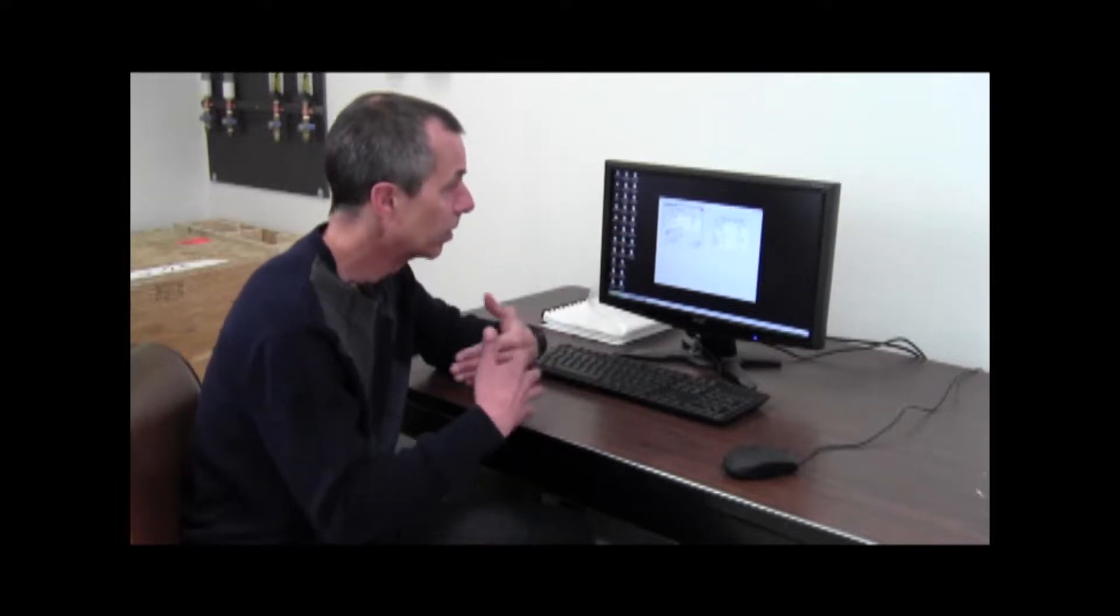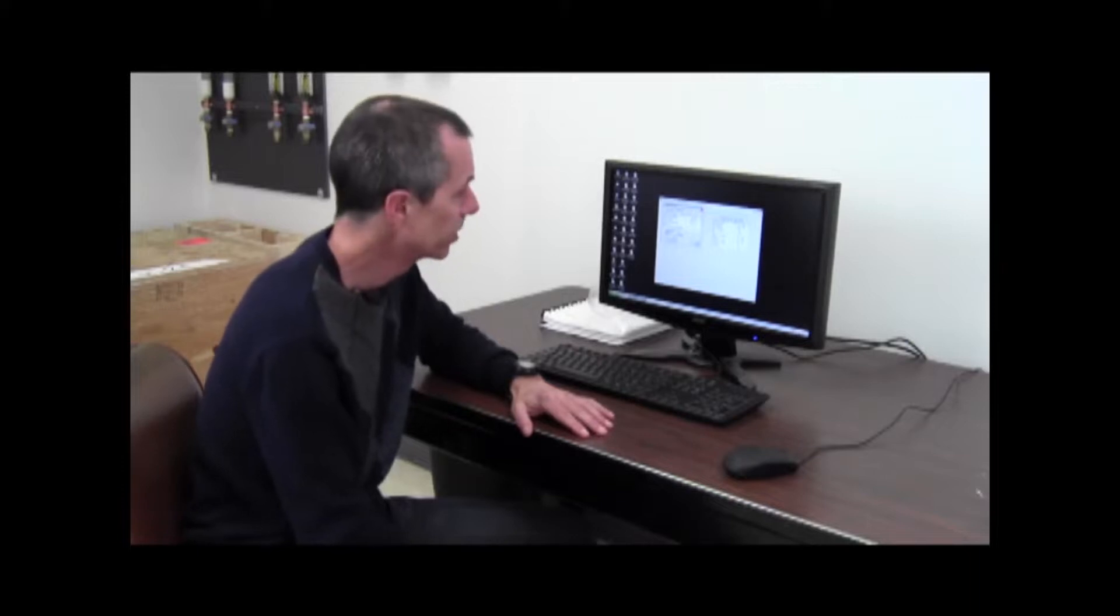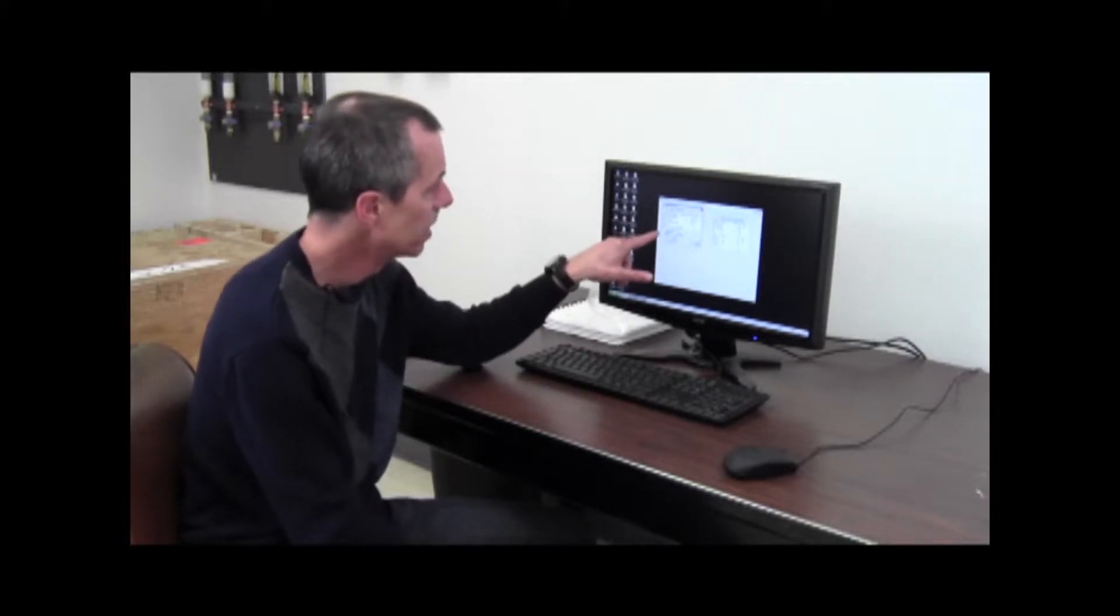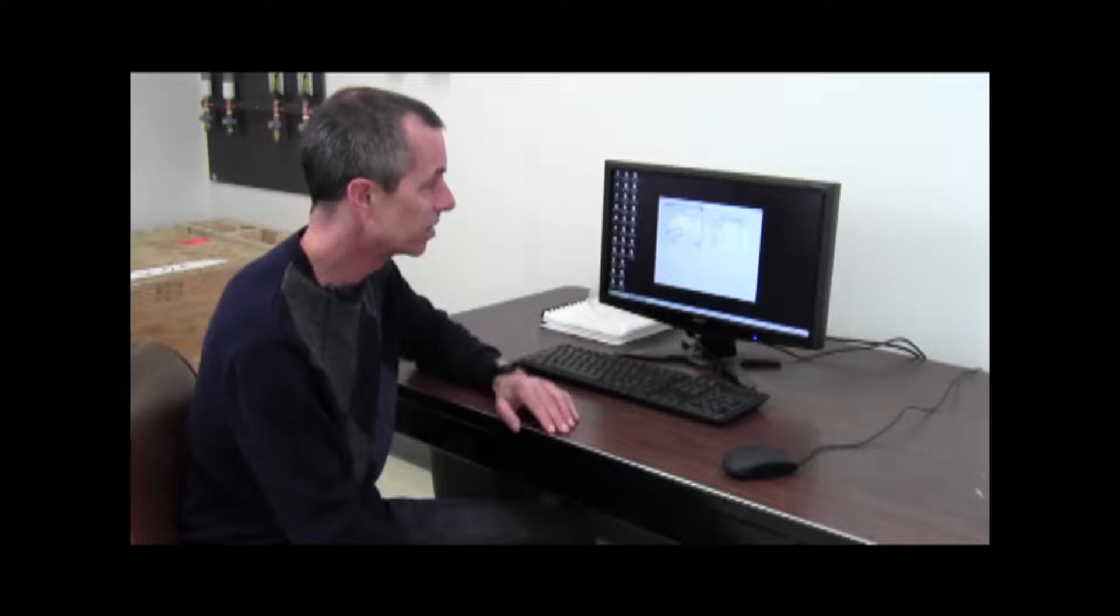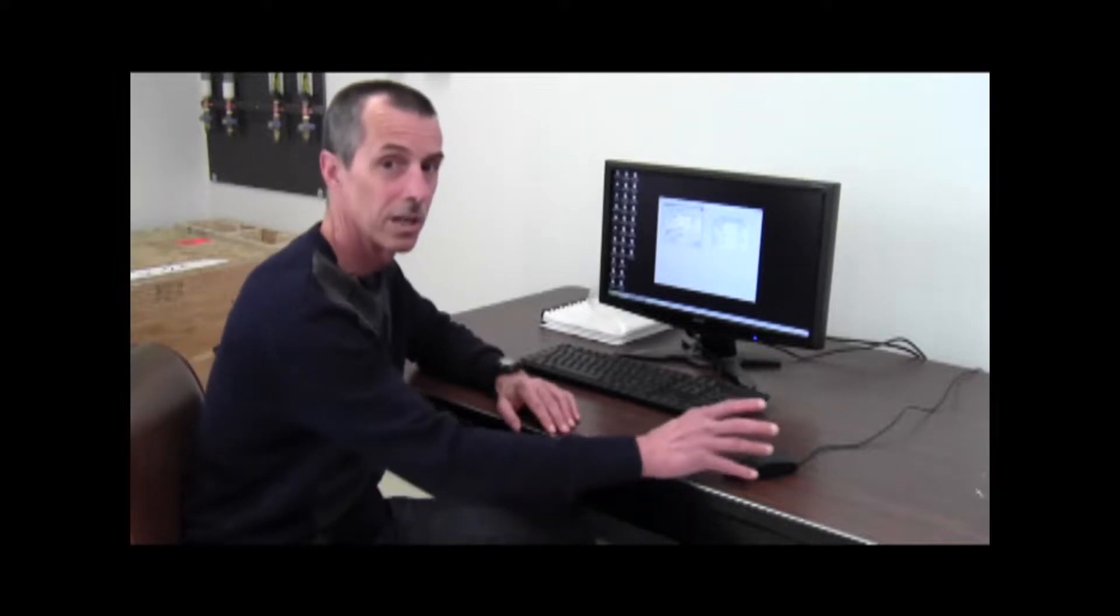My field steps are 40 ersted, and I'm going to record data at a time constant of 10 milliseconds. So, there are a little over 300 points in this hysteresis loop measurement, and as you can see from here, the approximated measurement time is nine seconds. So, let's go ahead and go.